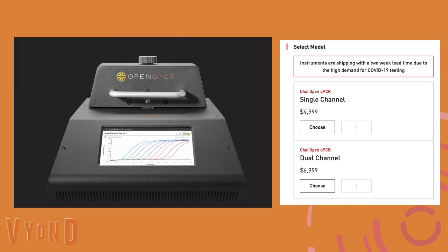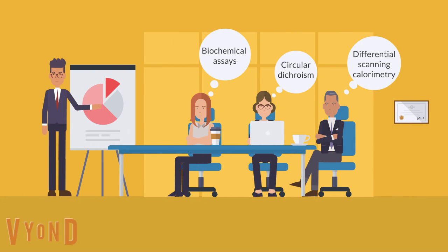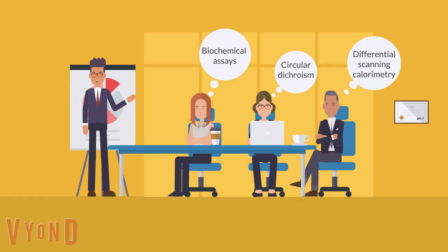qPCRs are less expensive and require significantly less labor than other methods, which could produce similar results to a DSF. Other methods to study protein unfolding are biochemical assays, circular dichroism, and differential scanning calorimetry. Biochemical assays, like the name implies, use different chemical compounds to chemically denature the protein. This is a low-cost option, but they require a very specific assay and need catalytic activity of the protein.